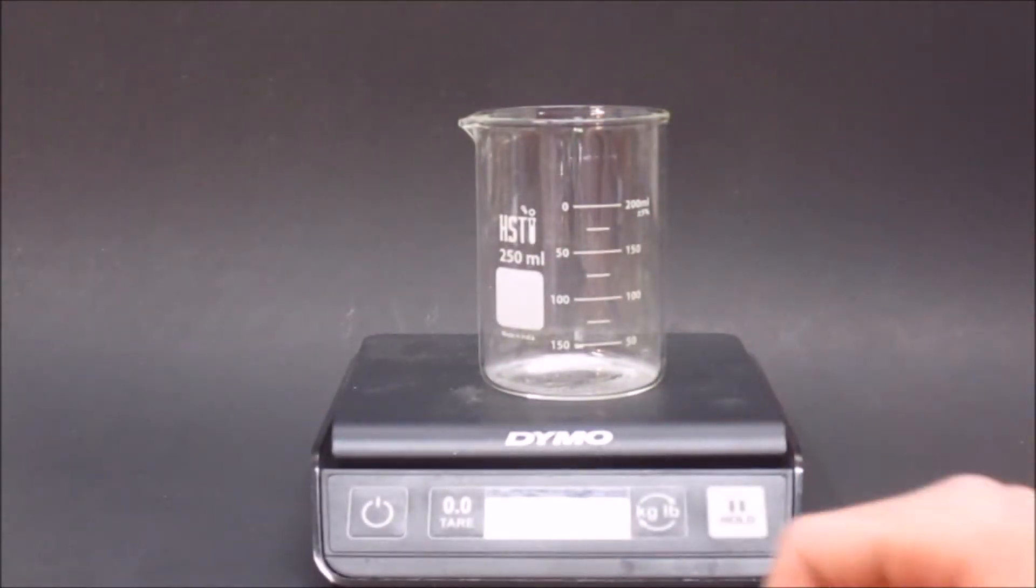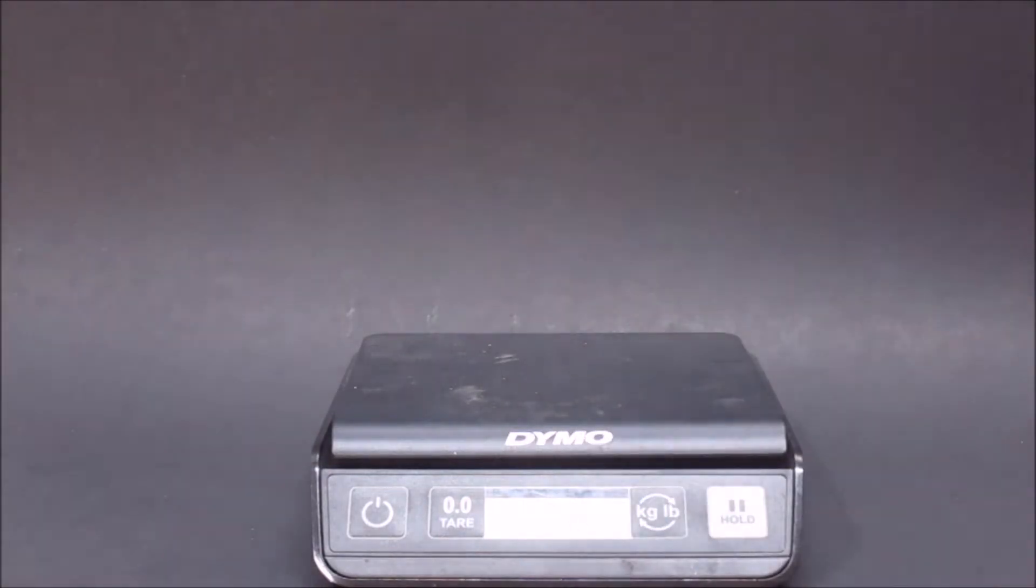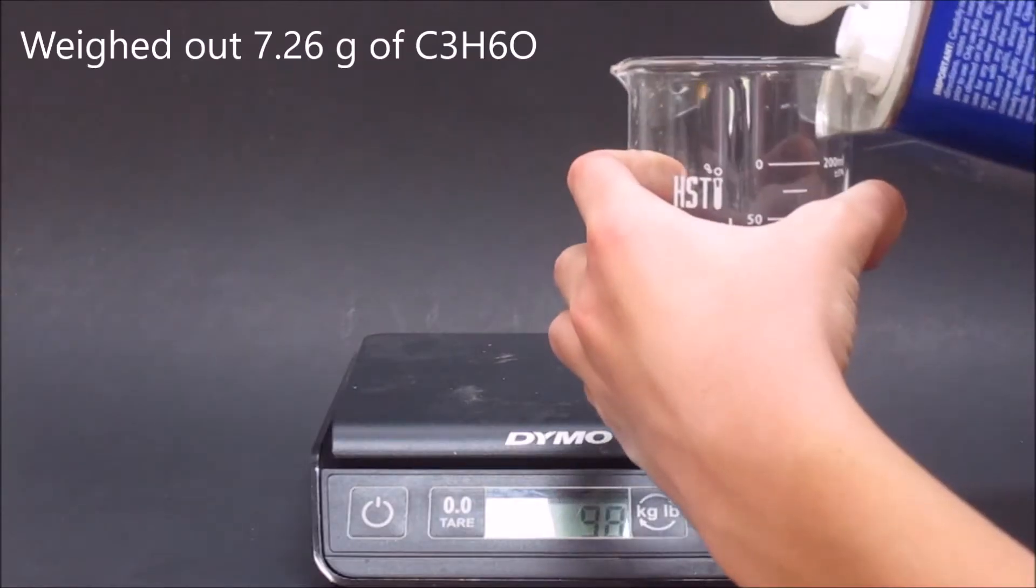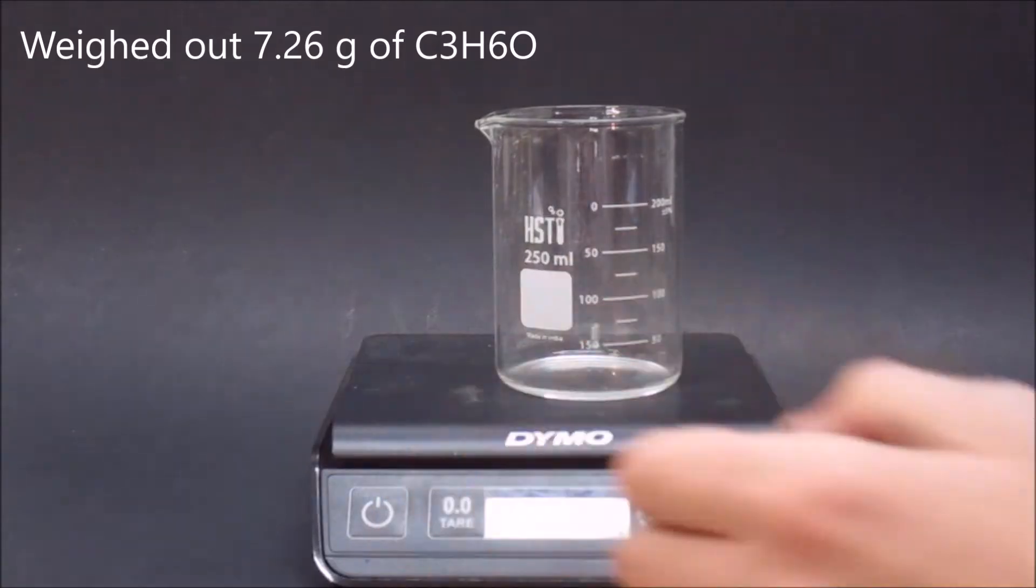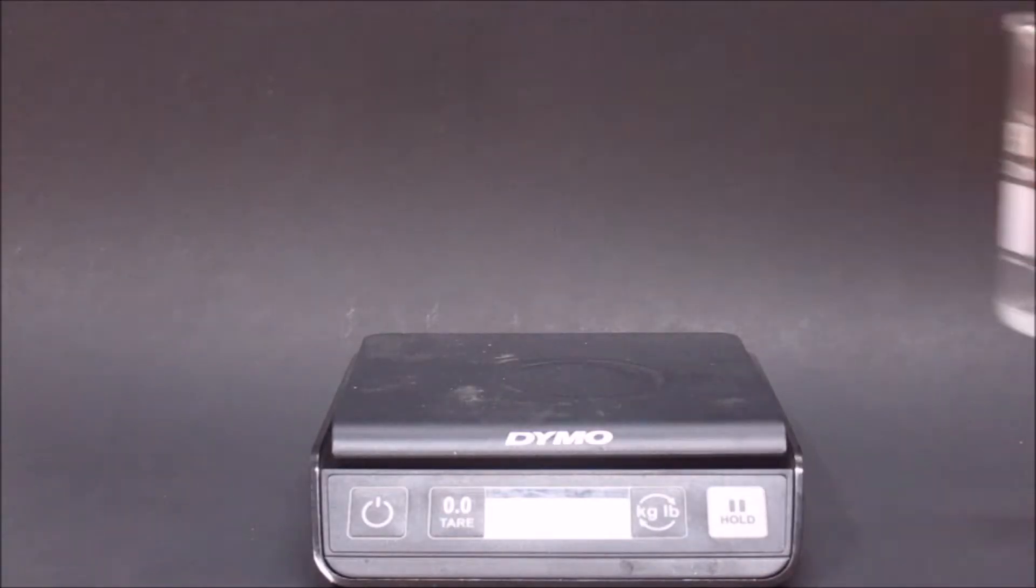I got a new beaker and put it on the scale, and then I weighed out 7.26 grams of acetone. Then I took the beaker off the scale.